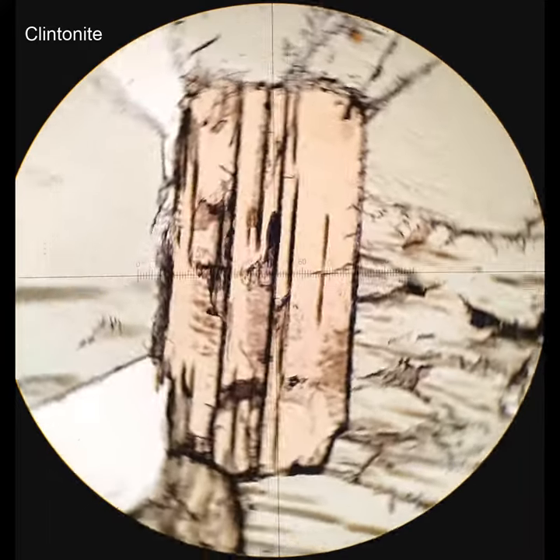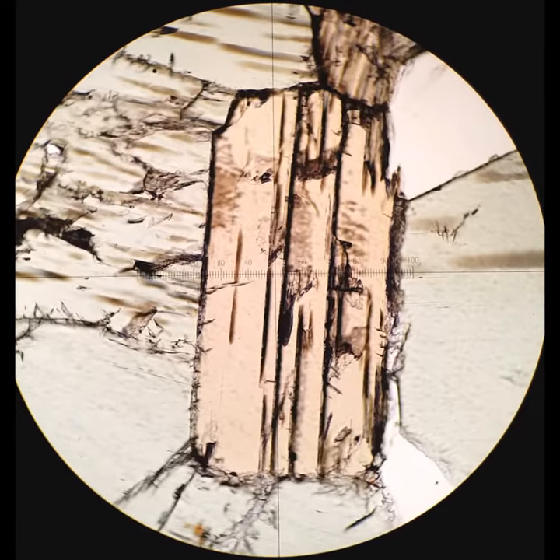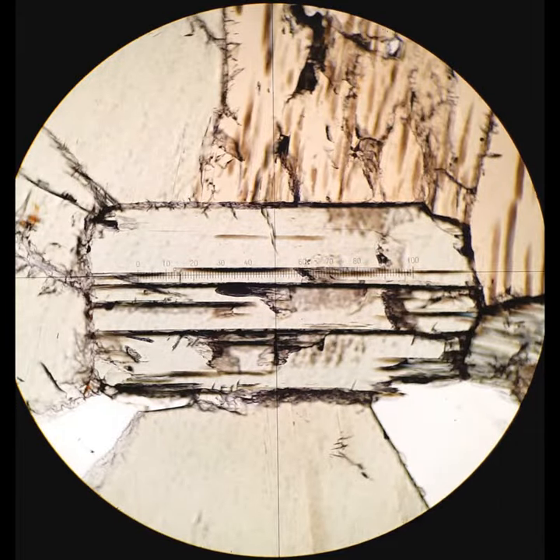I have only a couple of rocks with clintonite in them. Clintonite is kind of like biotite, except it has calcium in the alkali site instead of potassium. What's distinctive about it is it has this unusual green and orange pleochroism.